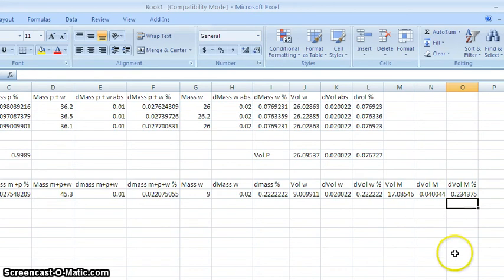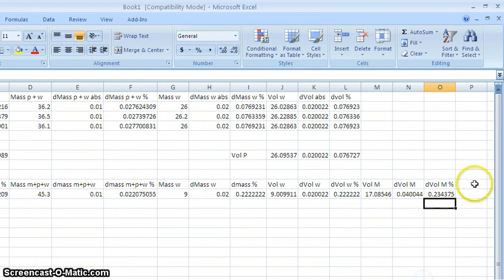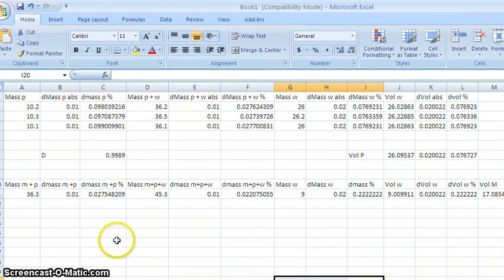One of the last things that I have to then do is to get the mass of the metal. So I will place those in. And what I have to do from before, let's see if I can slide this over. I have the mass of the metal plus pycnometer way over here, and I have the mass of the empty pycnometer here. It would probably be best to get an average value.